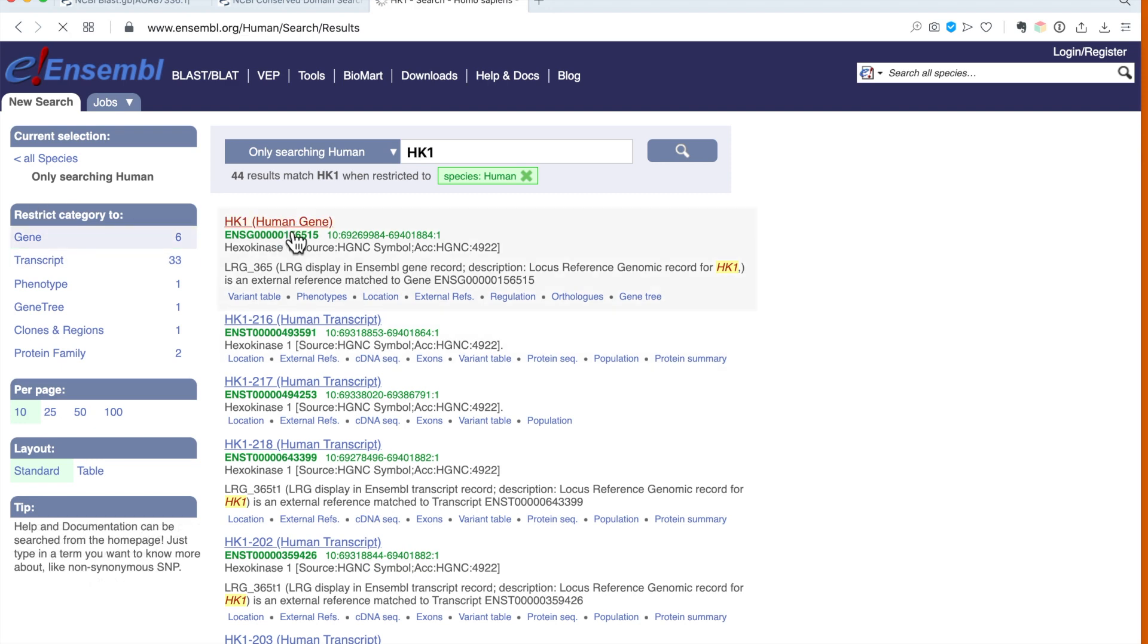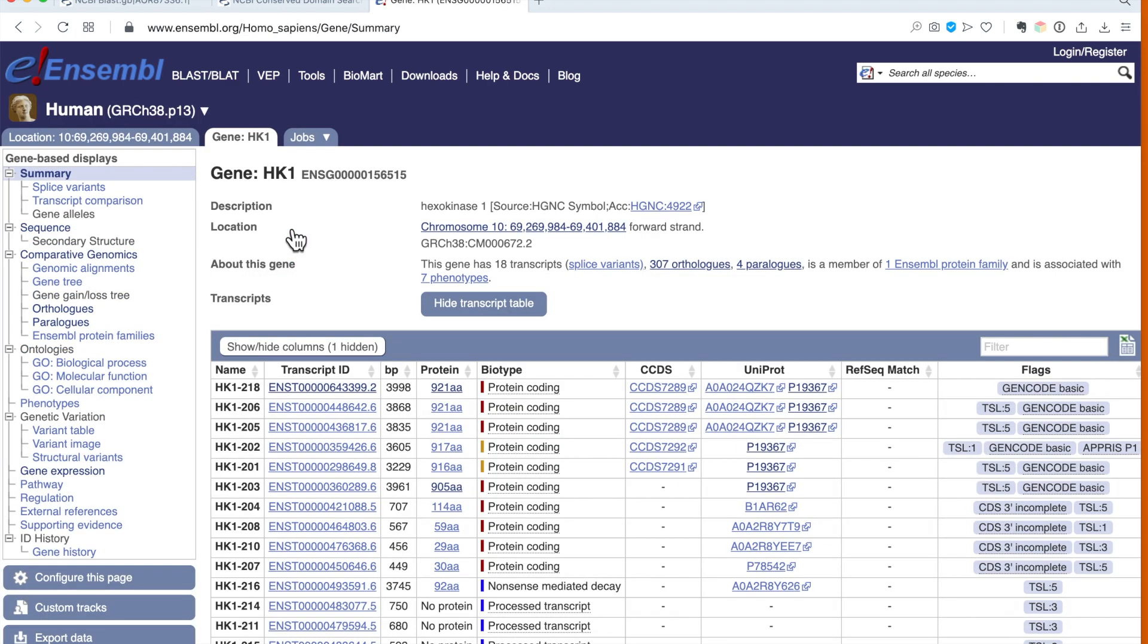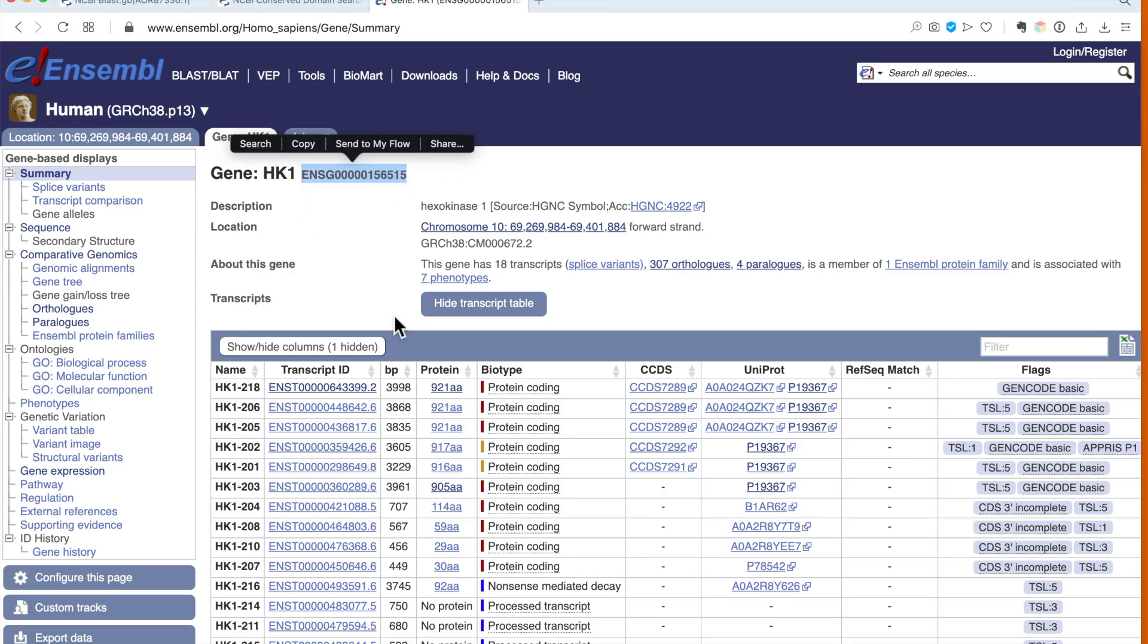Now in the entry, what is the gene ID? For BLAST, it's good to always have the accession ID. That's the safest way to get to the correct entry. So the gene ID is ENSG, the Ensembl gene ID. I copy that.